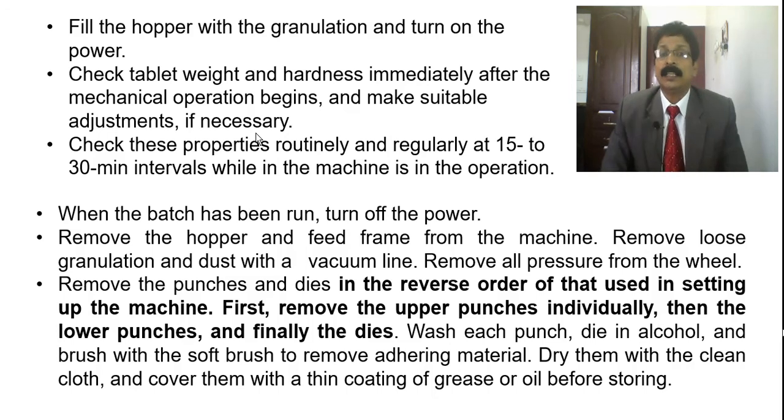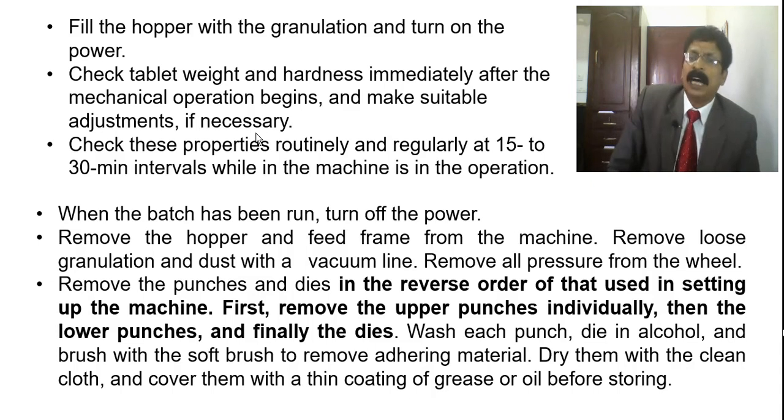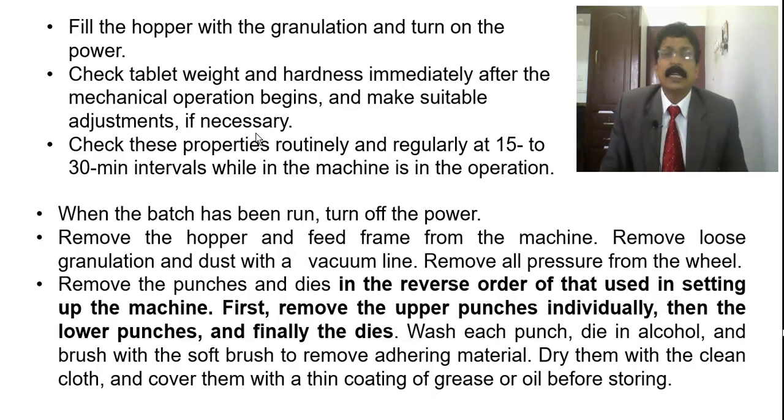So wash all the punches and dies with alcohol and a soft brush, remove adhering material, dry them with a clean cloth and cover them with a thin coating of grease or oil before storing.